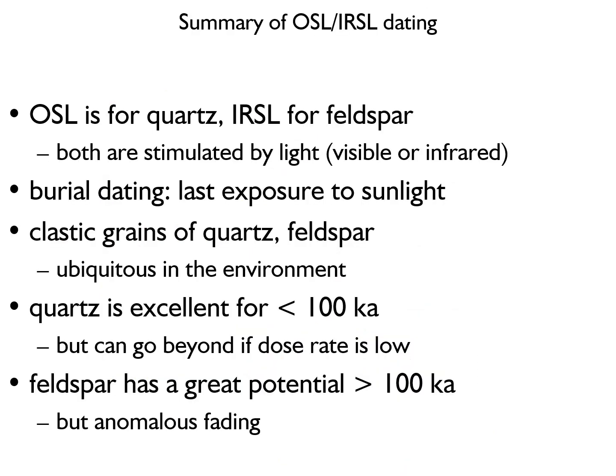And so, in summary, OSL dating is a burial technique. It measures the last exposure to sunlight. We apply it to quartz and feldspar minerals, and luckily for us, they are everywhere.